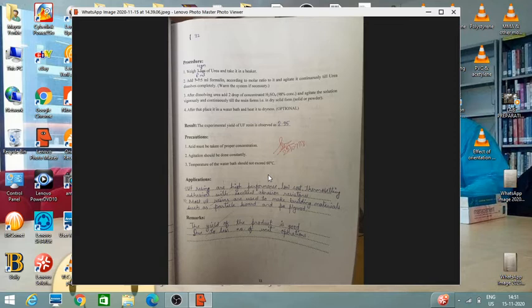So you know formalin is a colorless solution of formaldehyde in water.